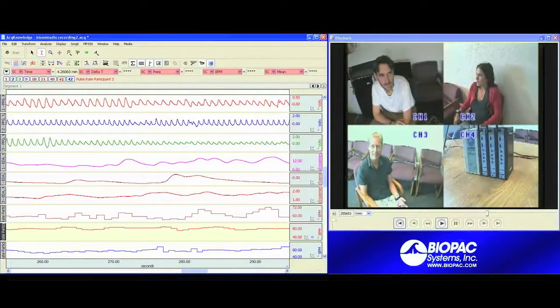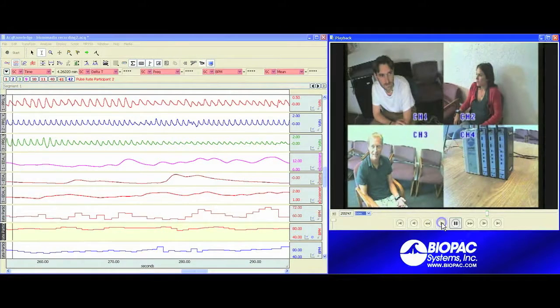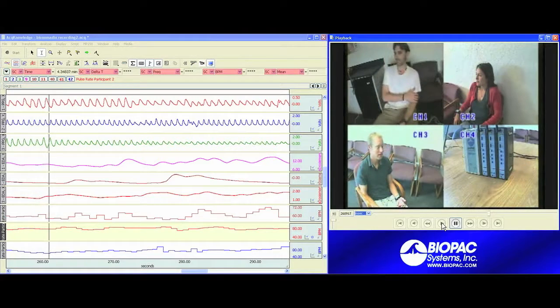Now that we've finished recording, we can take a look at how the video data and physiology data are linked for analysis. One of the easiest ways to demonstrate this link is to simply come to your playback viewer and click on play.